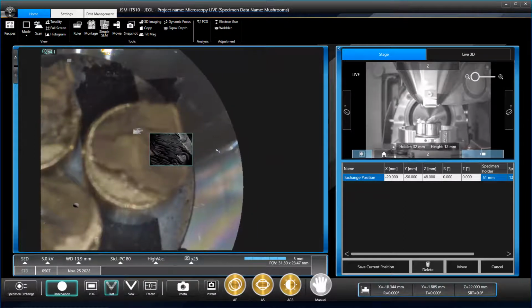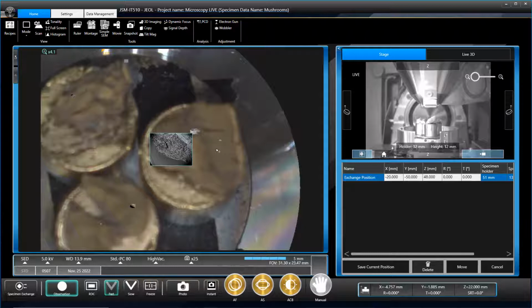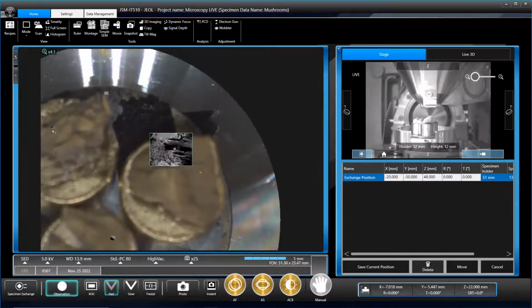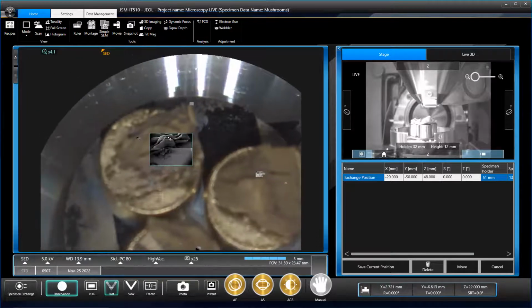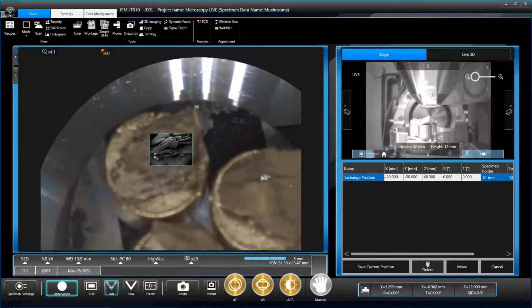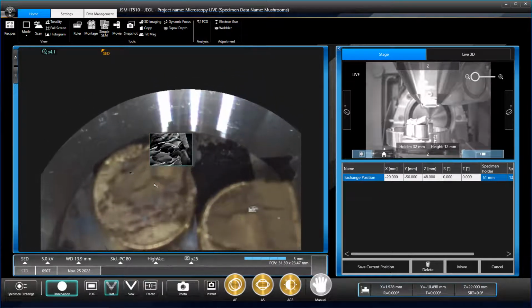Yeah, actually, they are different, aren't they? Because these were a lot more wavy, and the other ones were quite rigid. And what were these ones? I don't remember. That was the oyster mushroom. So these are the more wavy ones as well, aren't they? They're much broader as well. They also don't hold up to being dropped repeatedly.